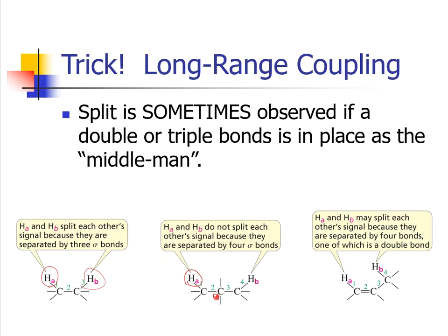And think about NMR that we just did here as an example. All right, so this carbon is actually the second one down. And that carbon doesn't really have an option to affect the main signal from the proton that we have labeled as A here.